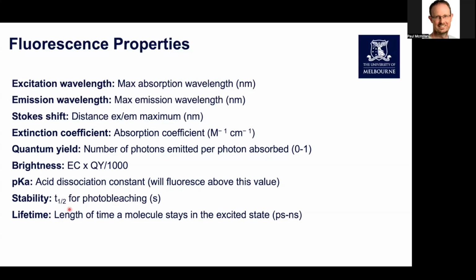We have photostability, so I mentioned the photobleaching issues. So, half time for photobleaching. And then I also briefly mentioned fluorescence lifetime. So it's the length of time the molecule stays in that excited state.